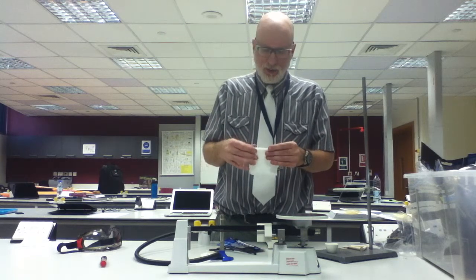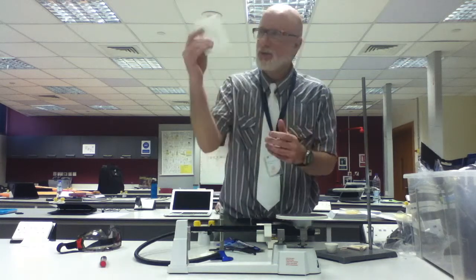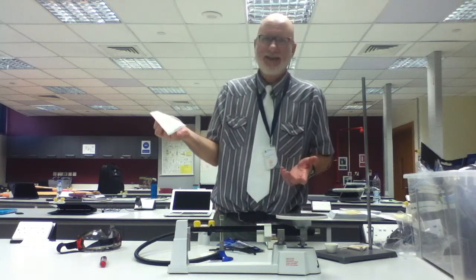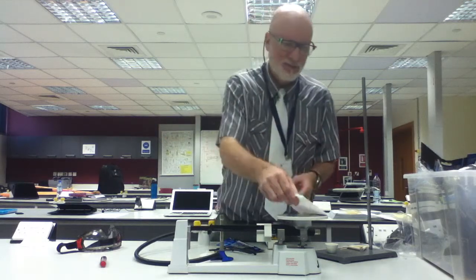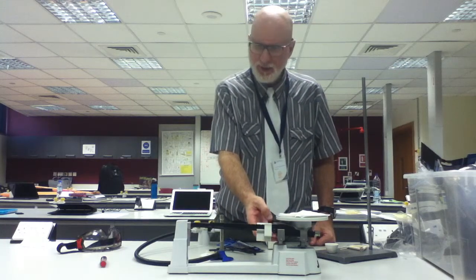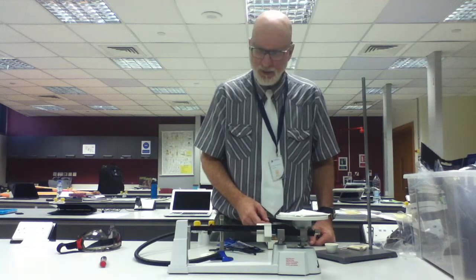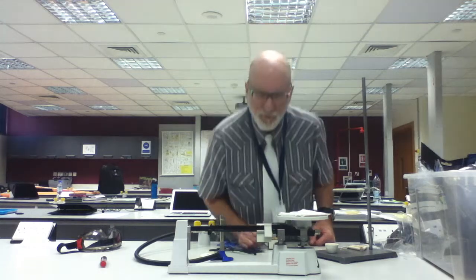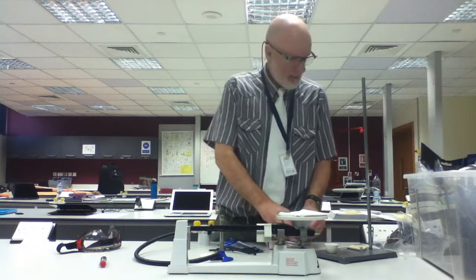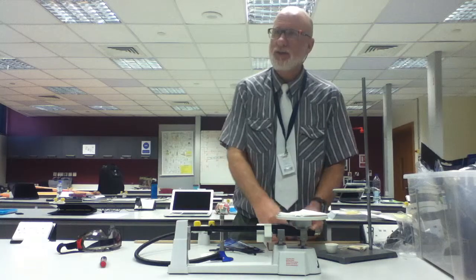This is just what I like to use. You want to make sure that you find the mass of this. Clear? Does that make sense? So you find the mass of this, then you move it and find the mass of this. The mass of this is 1.39 grams.